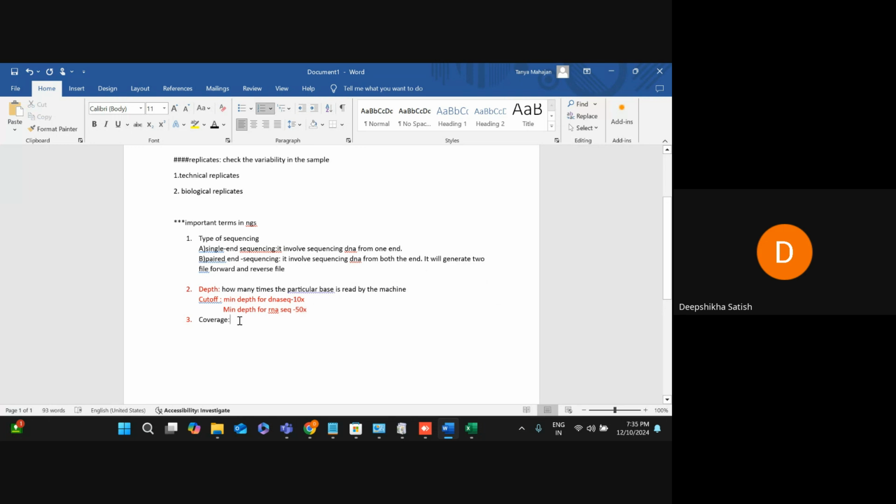Are you getting this? Yeah, just I have a curiosity when, for example, our depth is 4, because it's comparing to our reference genome. If for example we change our reference genome, it cannot be okay then.